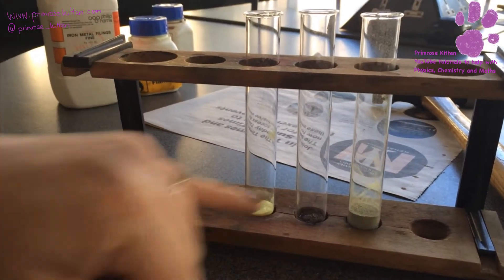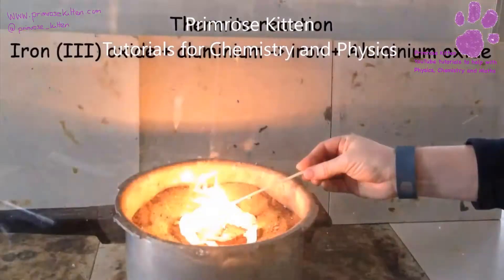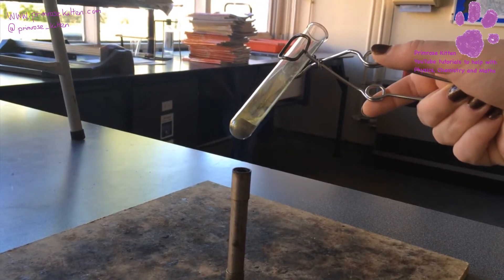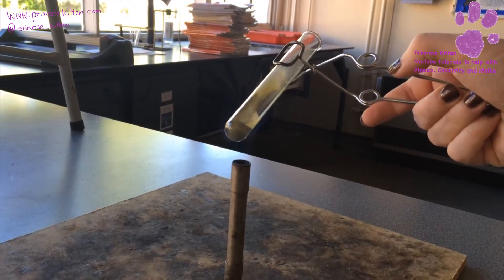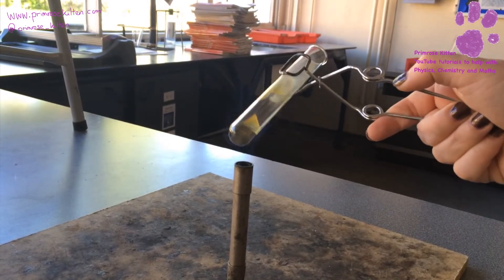So what we are going to do now is heat this mixture of iron and sulfur and see what happens to it. I am heating the mixture of iron and sulfur. You will notice that I am pointing it away so that any gases that come out of the top aren't directed towards anyone's face. And heating this quite strongly.